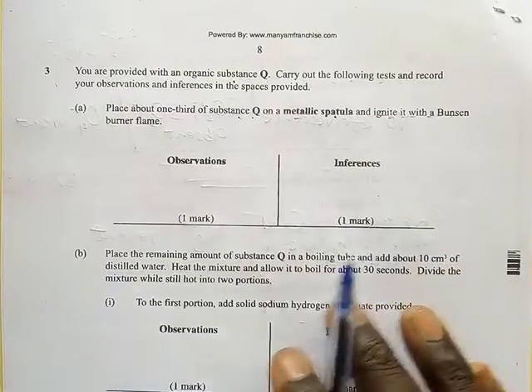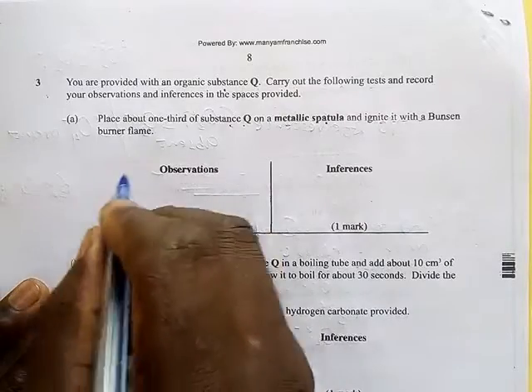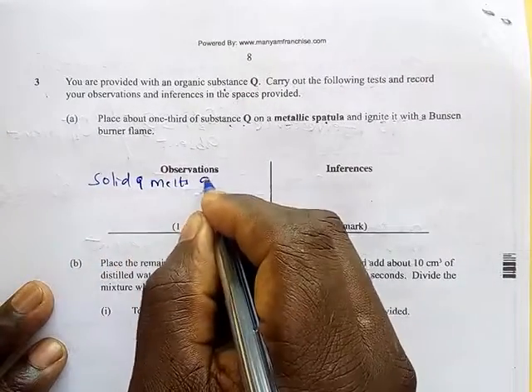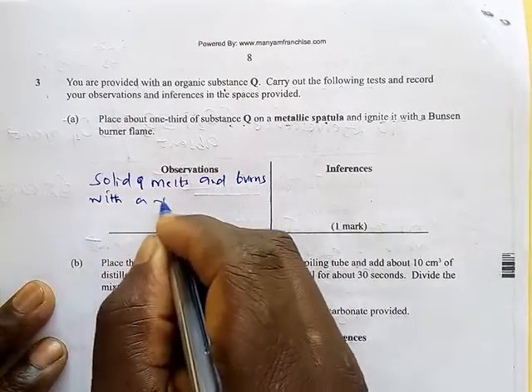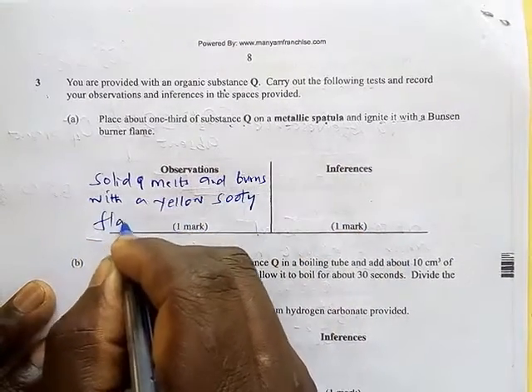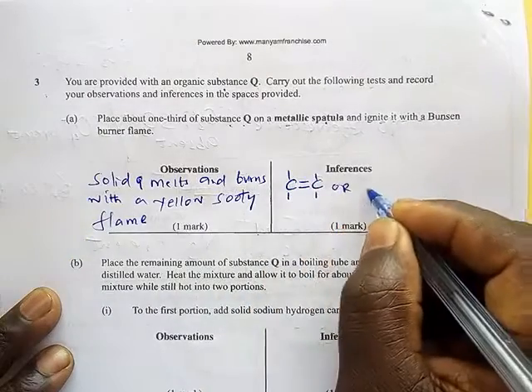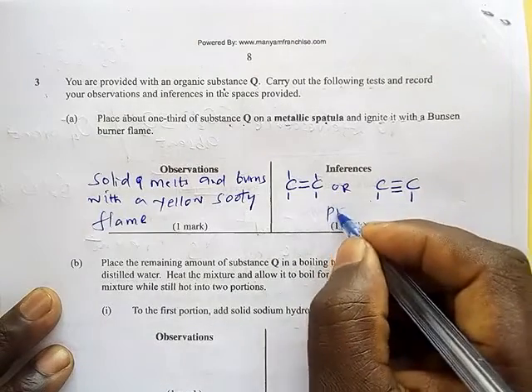The observation is that solid Q melts and burns with a yellow sooty flame. So if that happens, then you should know it is a double bond or a triple bond that is present.